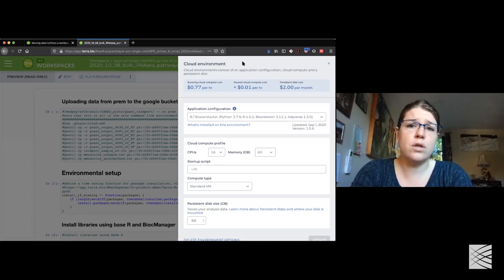This should work locally if you have RNA-seq data locally, or if you're attached to one of the Samba shares, such as helium or iodine. Helium is the one that we use for MedPop AFib, or MedPop rather.